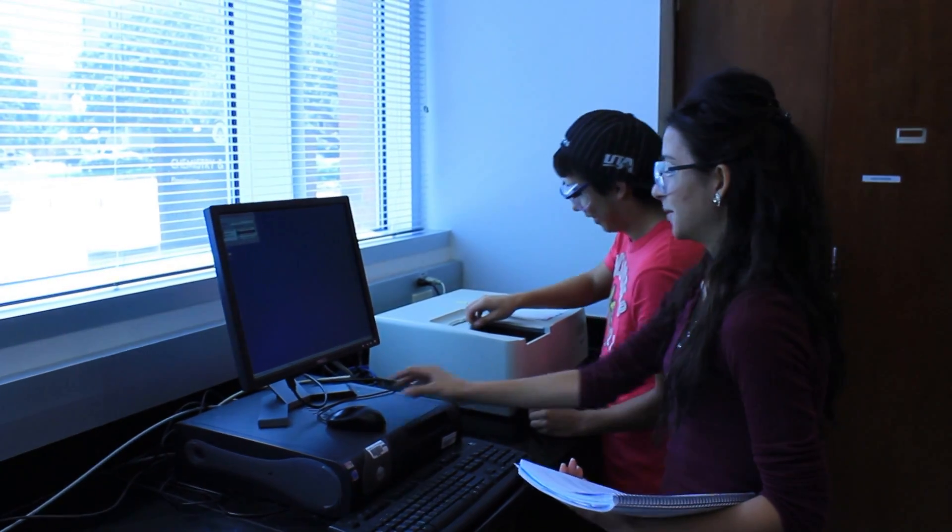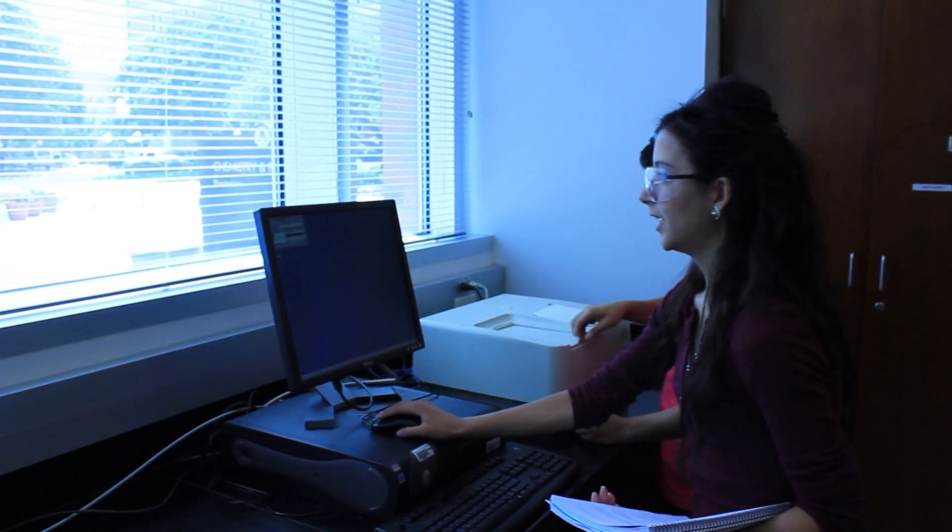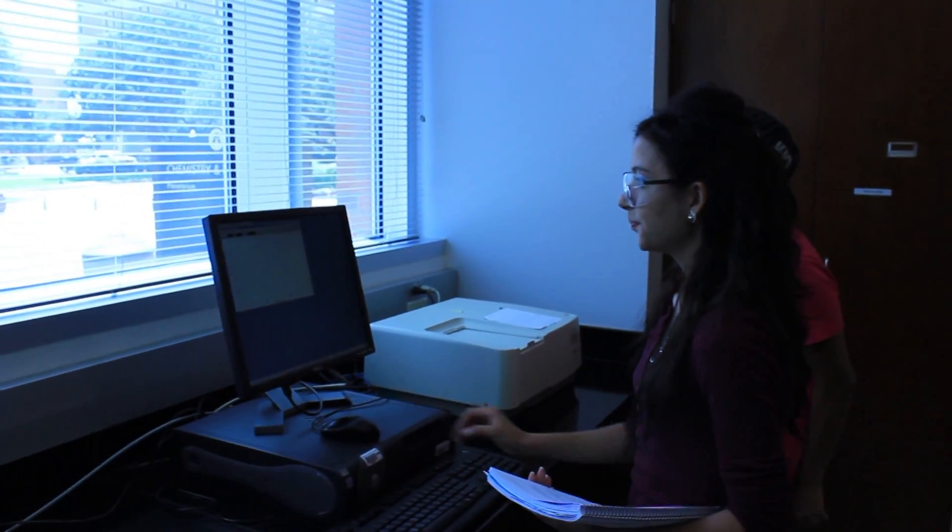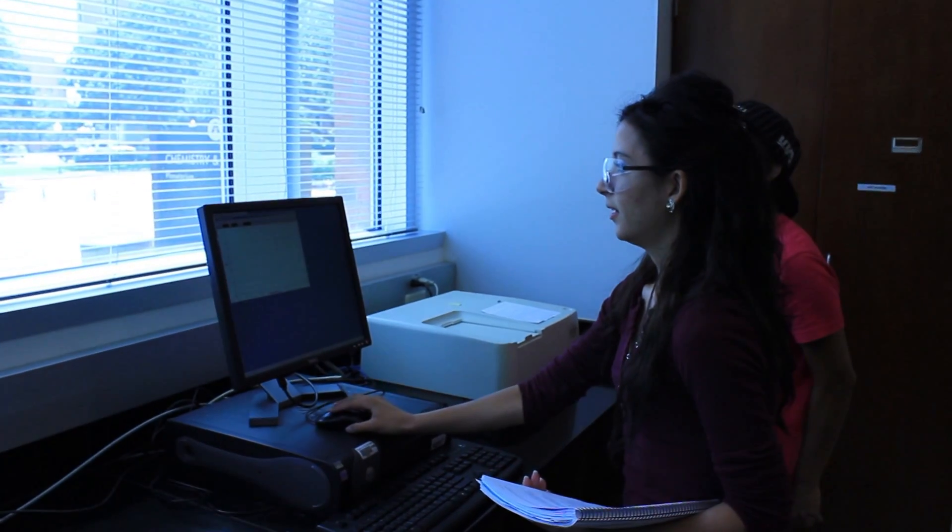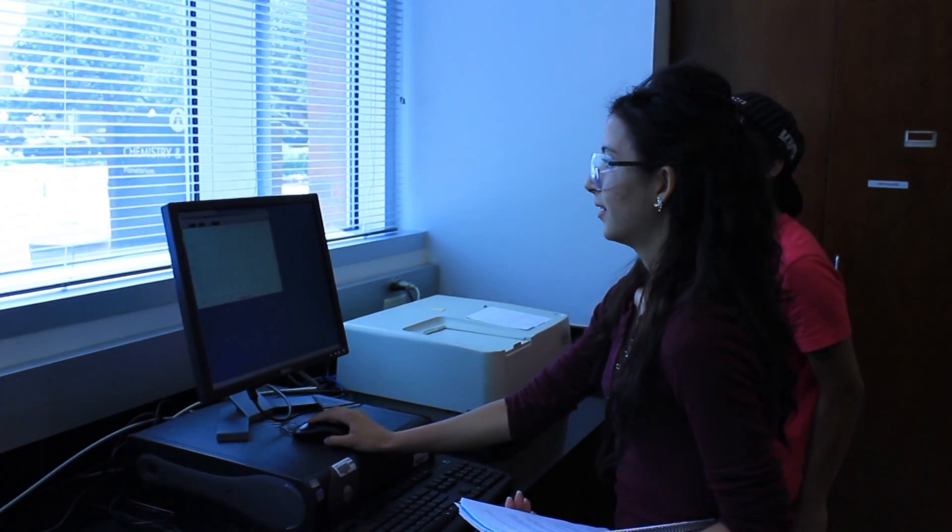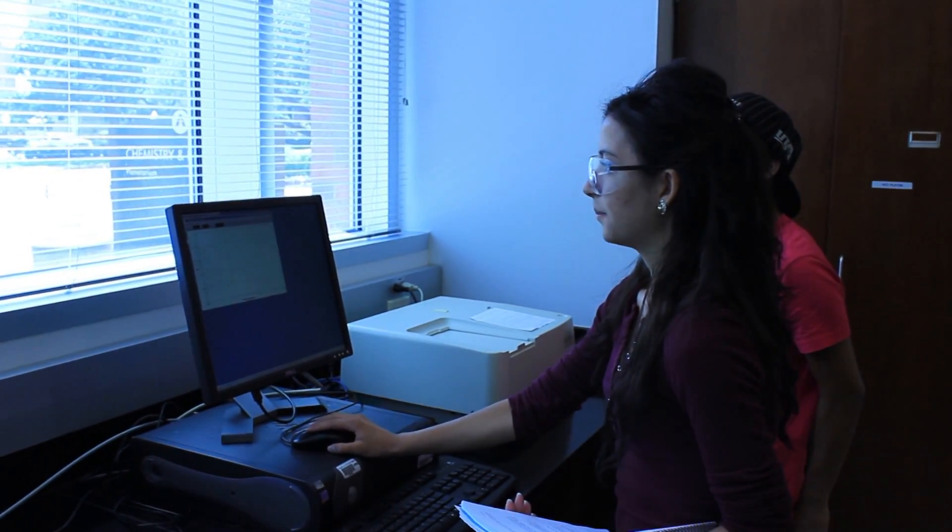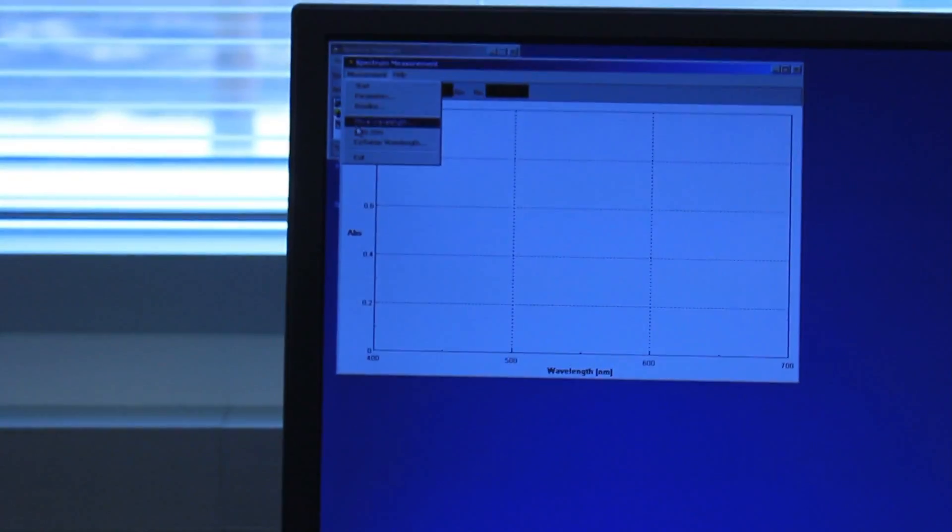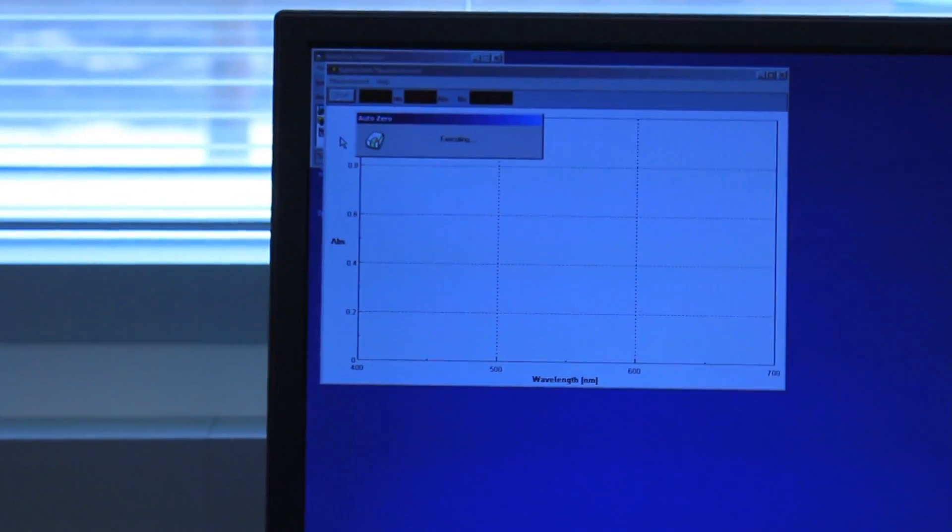Close the machine and click on spectrum measurement. When that pops up click on measurement at the very top and auto zero.